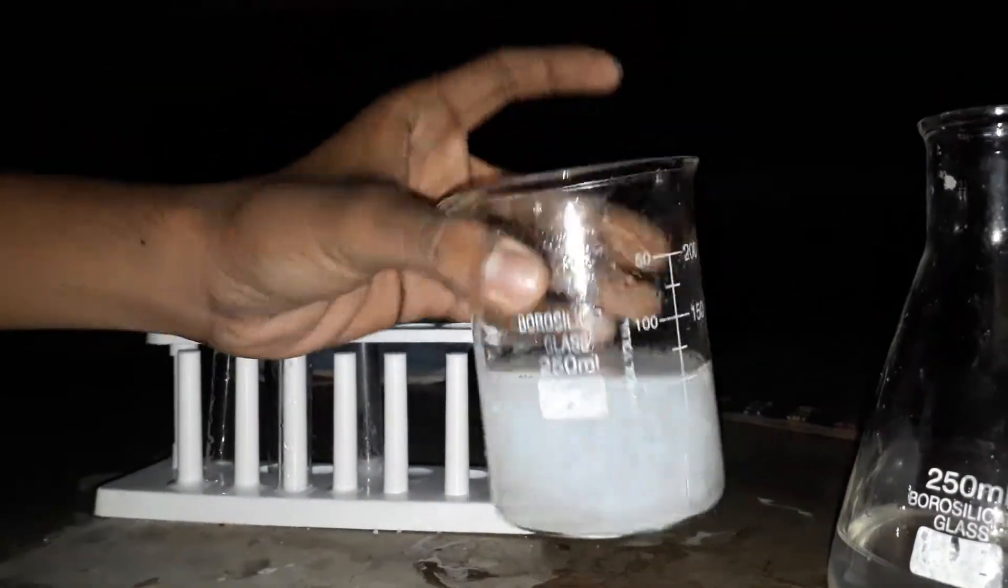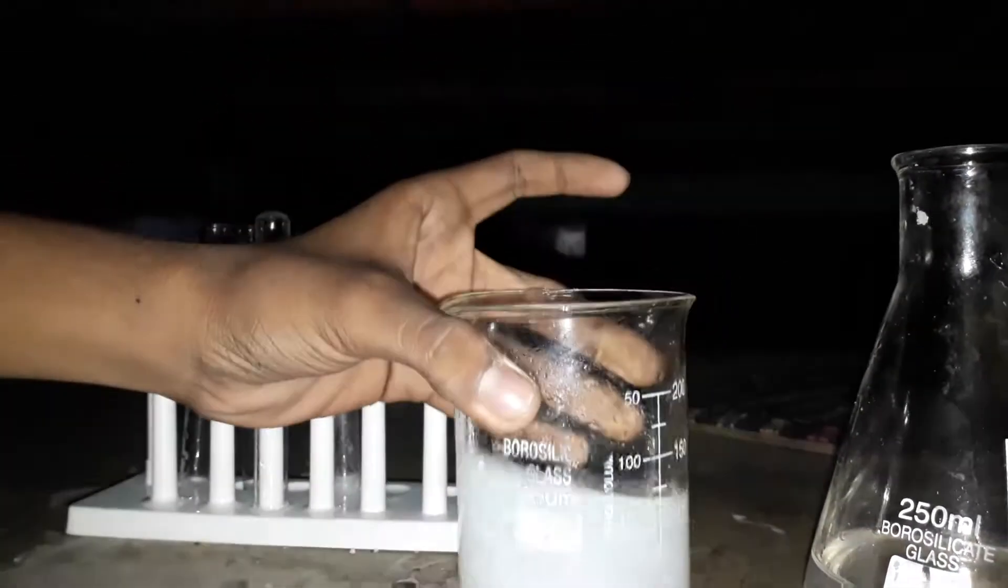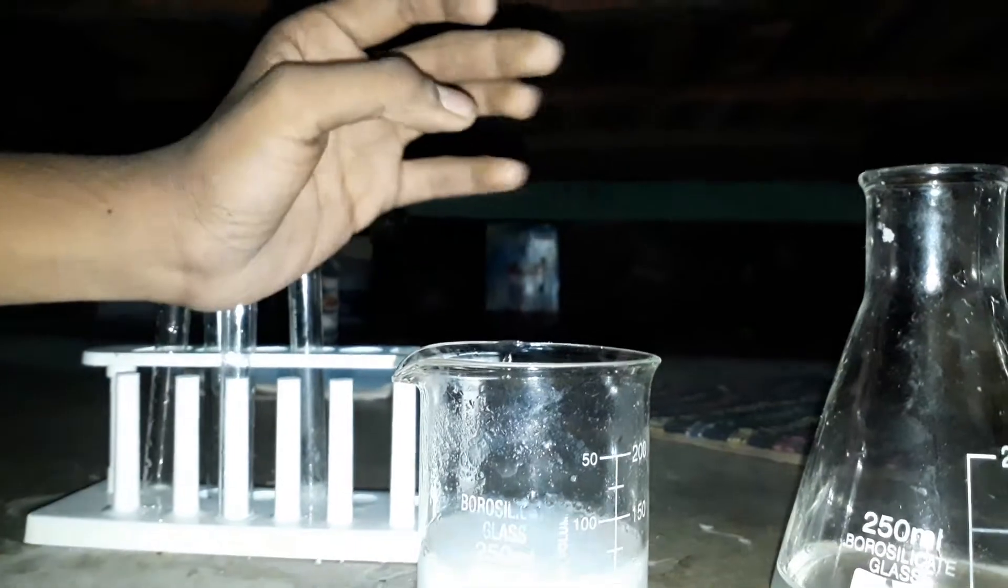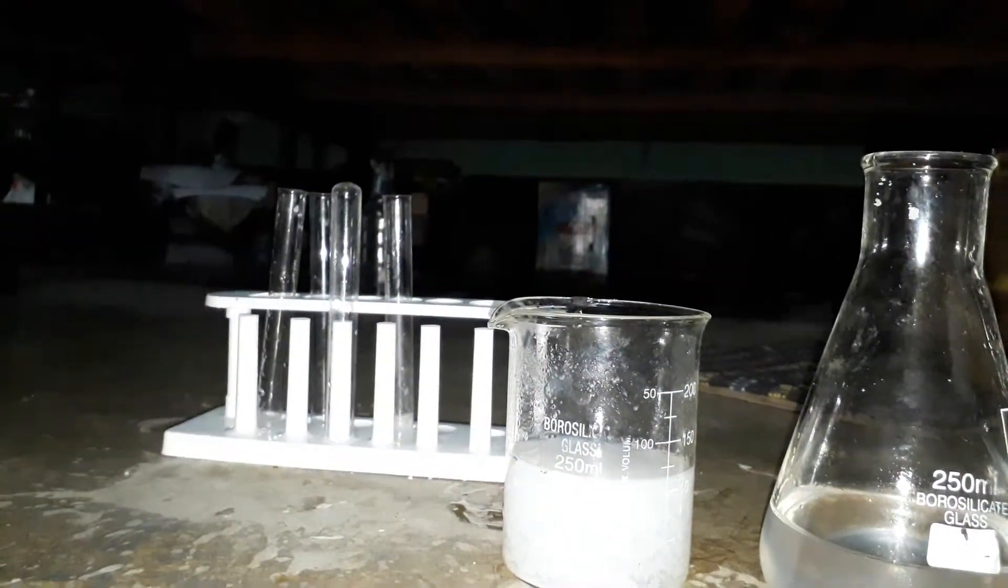As you can see there is a white precipitate that indicates the presence of magnesium ions in this solution. So this is Mg2+ solution and this is Na+ solution, because it was magnesium sulfate heptahydrate and it was sodium chloride or daily food salt.